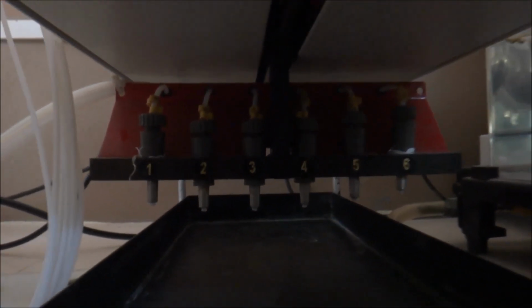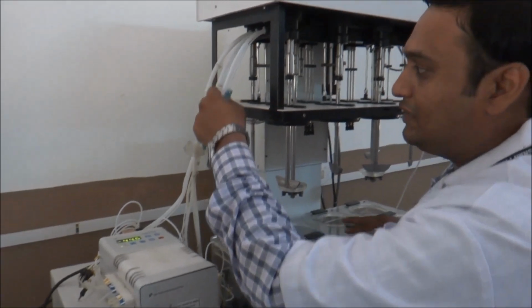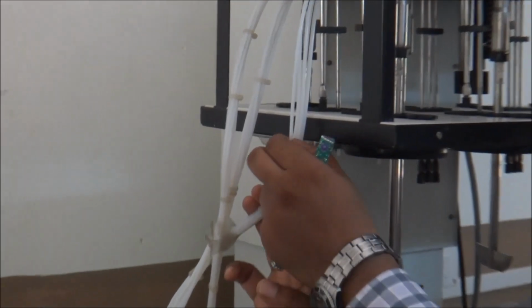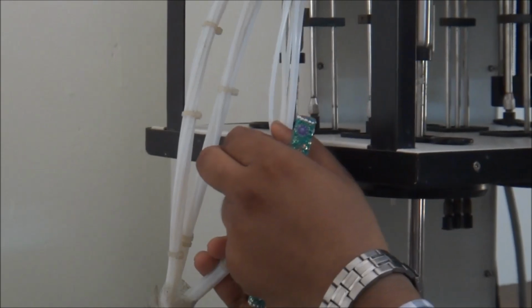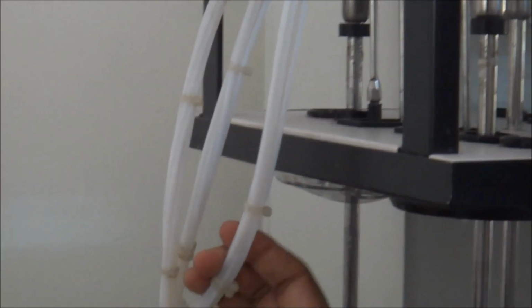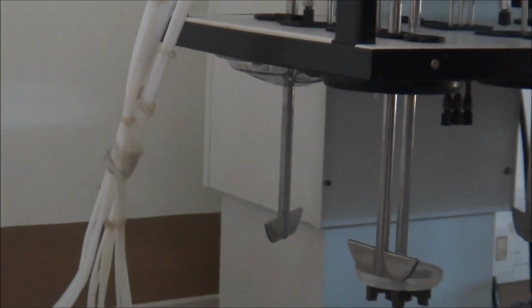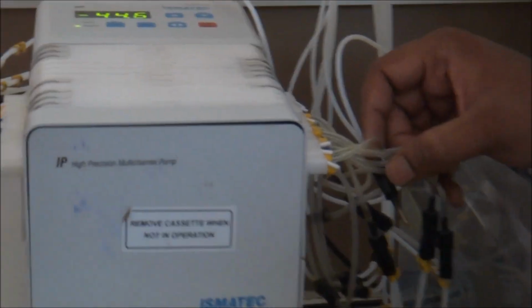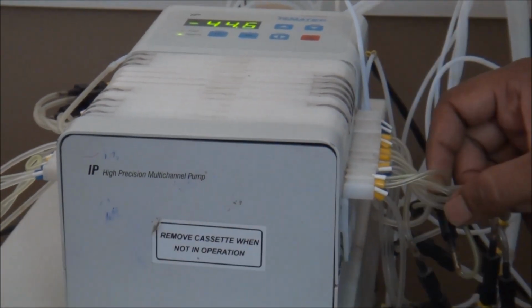Now the samples from the container are collected by the automatic sampler using the tubing system. As you can see, we have got 3 sets of tubes, and each set has 6 individual tubes. Each tube indicates one basket. One set of tubes, connected here, particularly this 1, 2, 3, 4, 5, 6, is generally for sucking the sample, and after sucking the sample the pipes will be filled with the solvent system and might have trace amounts of drug.